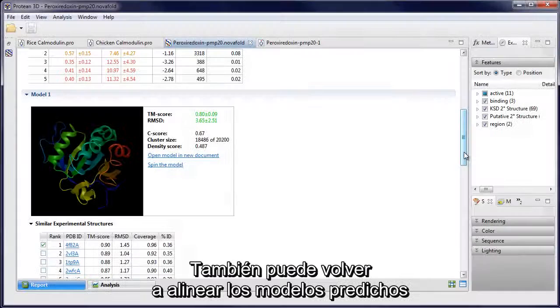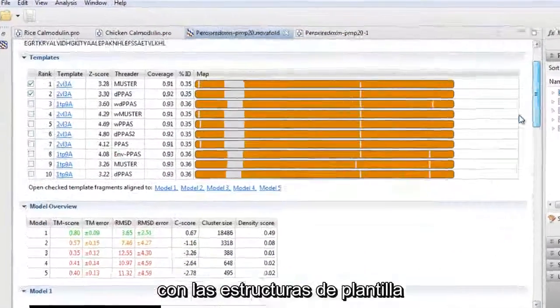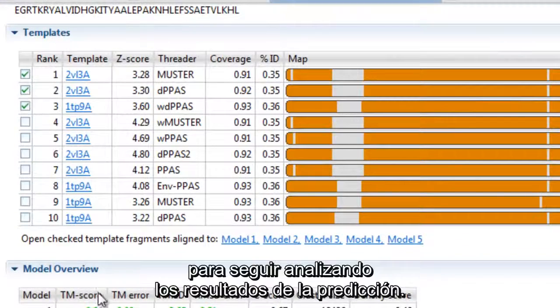You can also align predicted models back to template structures to further analyze prediction results.